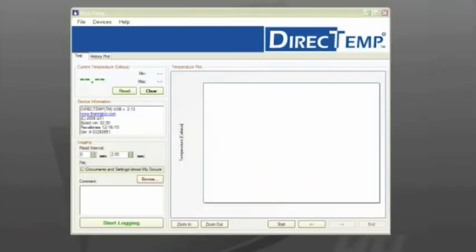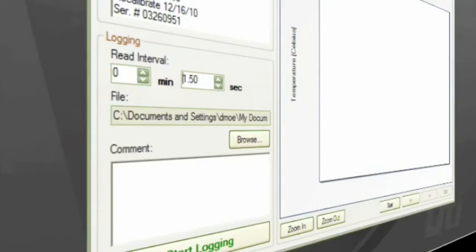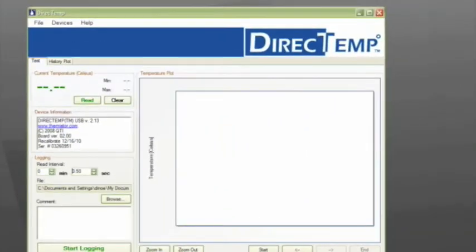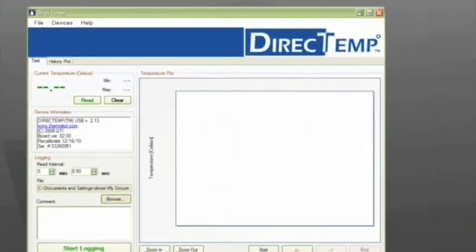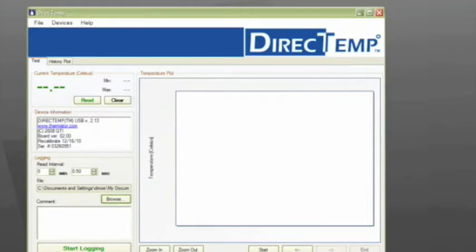You can have an audible alert for both low and high limits, have a pop-up window appear, or generate an email. So let's collect some data, but before we do so, I'm going to adjust the logging interval to a half a second and create a file by clicking on Browse. For this demonstration, I will name the file demo and save.